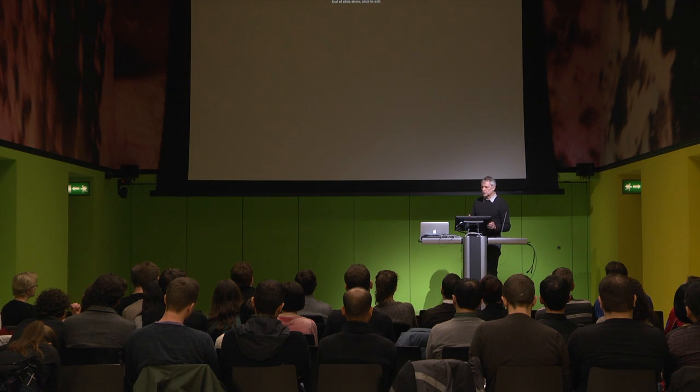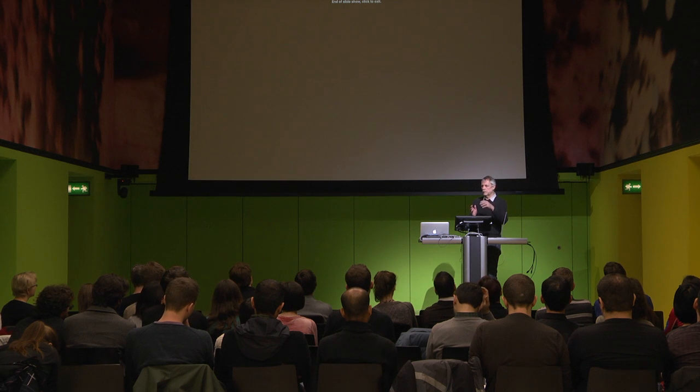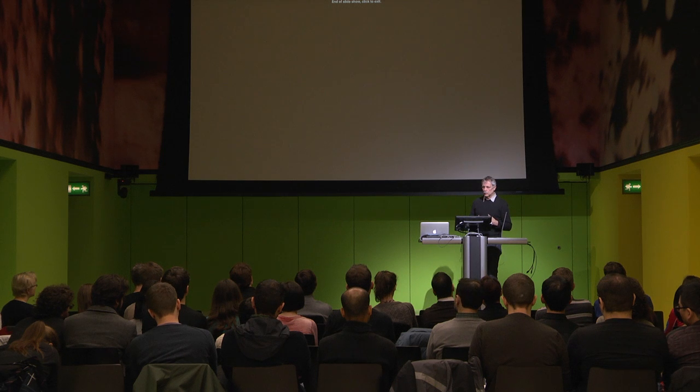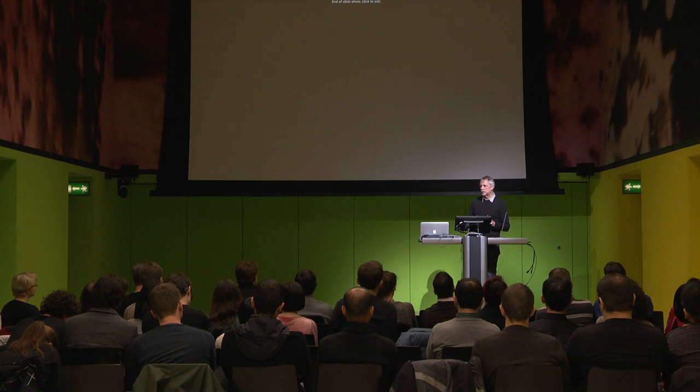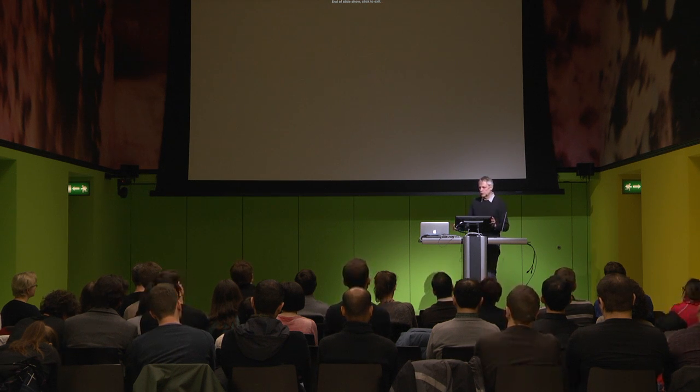And we have a number of projects in the laboratory where we do exactly that with very interesting results, including that one here. But you're certainly right that by having this somewhat myopic view, we do not recognize if something is happening in another connected process. And so we think that the newly emerging DIA techniques, like SWATH or what Biognosys calls hyper reaction monitoring, go in that direction: we now get a more global overview, but not a complete one.